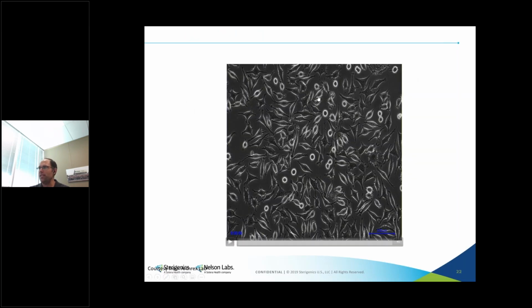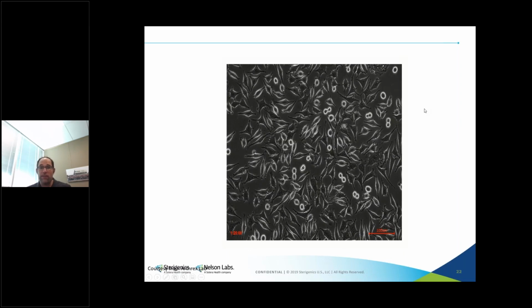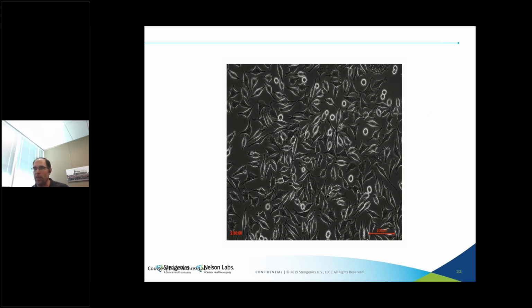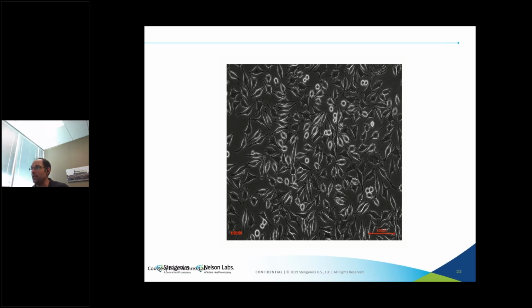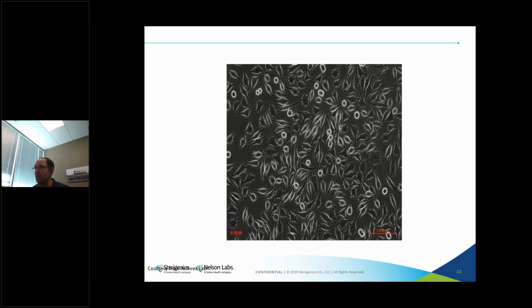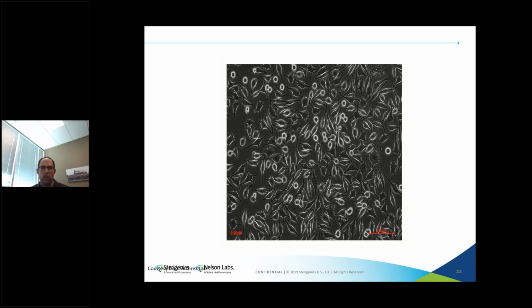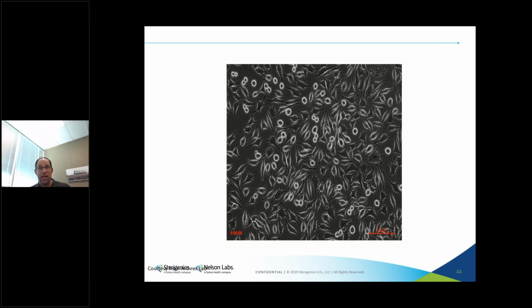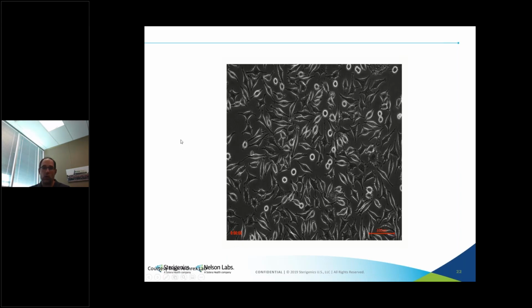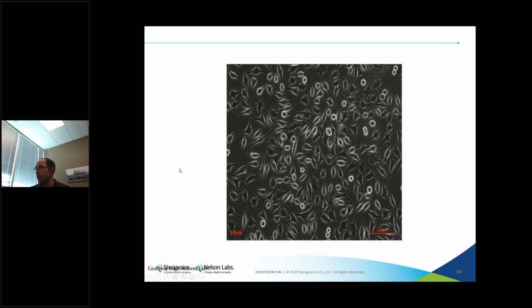And to give you a little bit of a sense of what the cells look like when they're growing, this is the movie that I showed during the holidays to my family to help them feel like they're biocomp experts too. This is just the cell line over 8 hours under microscopy, and you can see how they're growing and splitting. This means they're healthy and happy. So you can look at the cell line in real time to understand what happens to them and understand the potential toxicity. So if you want this to show to your own family during the holidays, just let me know. I'm happy to send it over to you.